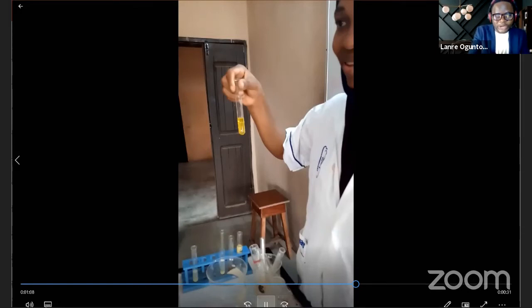Now the primary alcohol can be oxidized, where you add an oxidizing agent to it. The oxidizing agent we are using is potassium dichromate. When you add it to a primary alcohol, you are going to form two things.